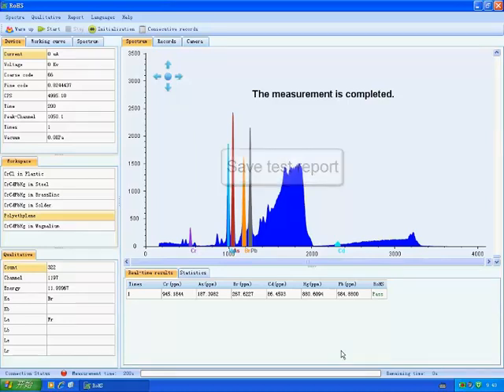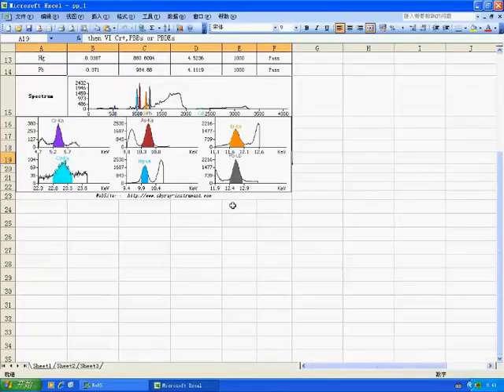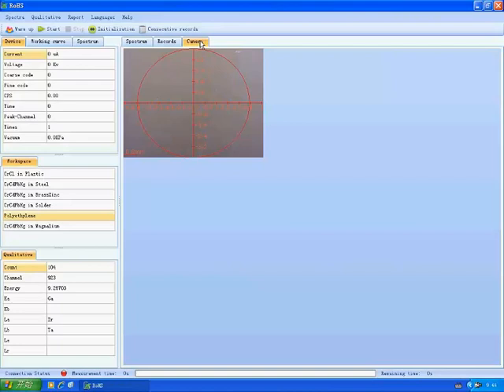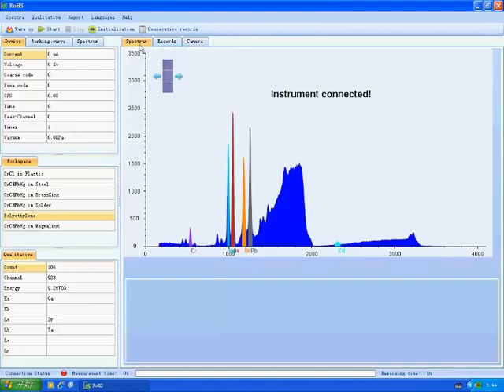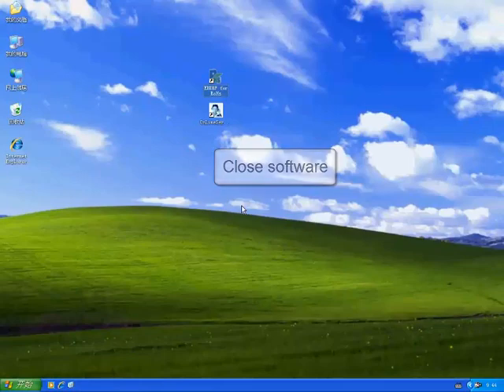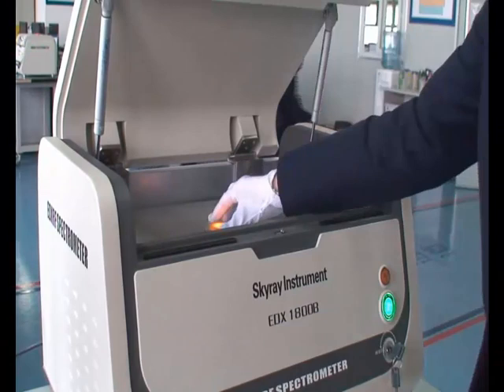After measurement, we click Result to check the test results. Click Save, then click Confirm to open the saved test report. After the test, close the software. Lock high pressure. Power off the instrument.